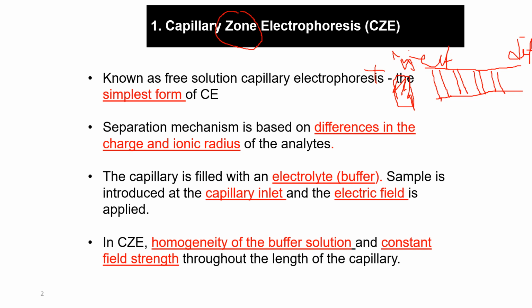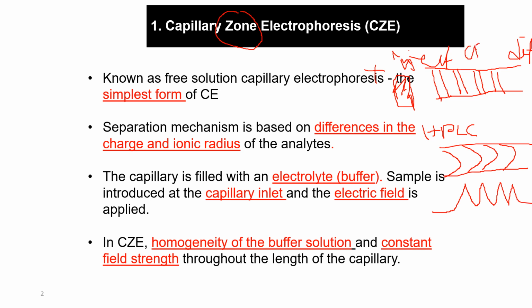If you see from the zone side, it is in contrast with what we have in HPLC. In HPLC, I showed you before that if we have the same 4 analytes, they are moving like a bullet. Why? Because we have all those laminar flow, diffusion, everything, right? So that's why you have a peak like this, a bit broad. In CE, the other way around, we have very efficient peaks, because it is moving like zones. That is the meaning why we call it zone electrophoresis.